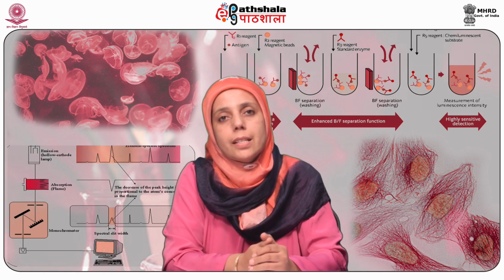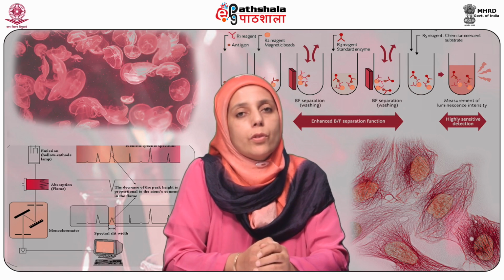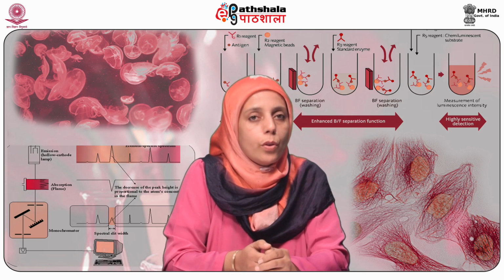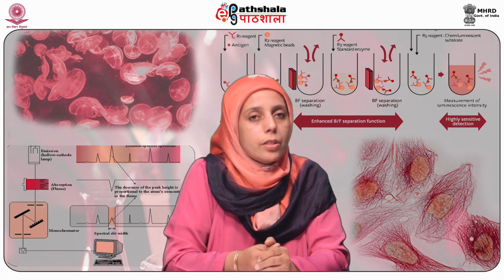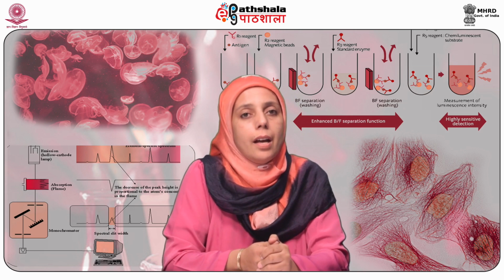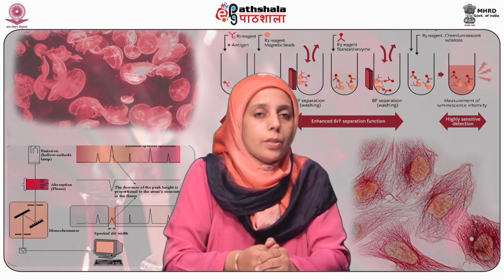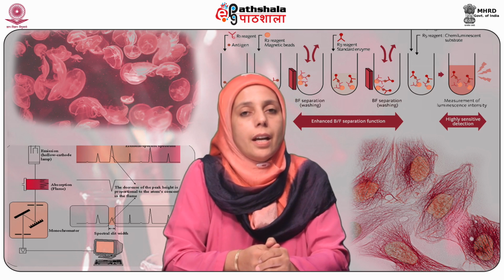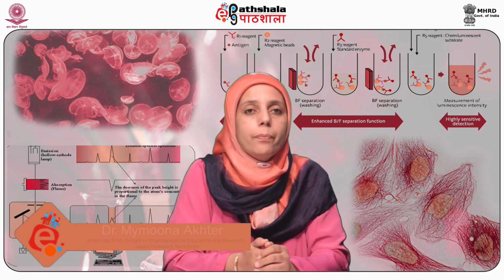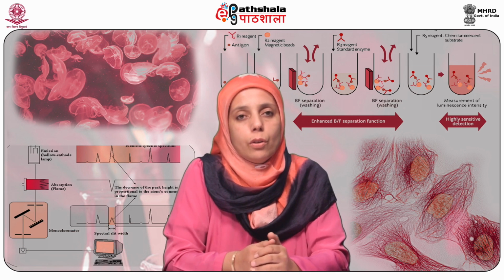So students, let's summarize what we have learned in this module. We discussed fluorophores, the requirement for a chemical to be a fluorophore, its definition, the characteristics of an ideal fluorophore, how many types of fluorophores there are, intrinsic and extrinsic fluorophores, covalent and non-covalent types of fluorophores, their use, and the advantages and disadvantages of some of the fluorophores, and their photostability when they are exposed to light in the study.